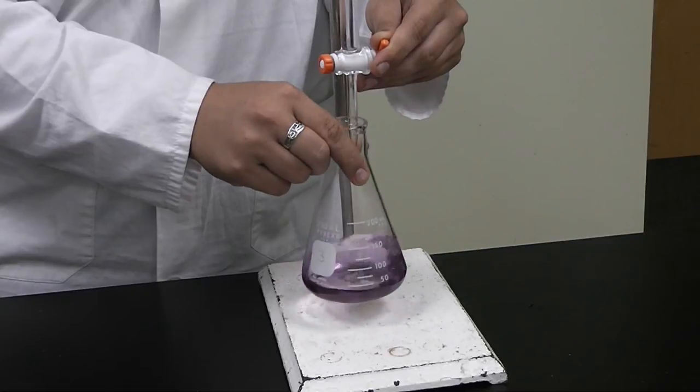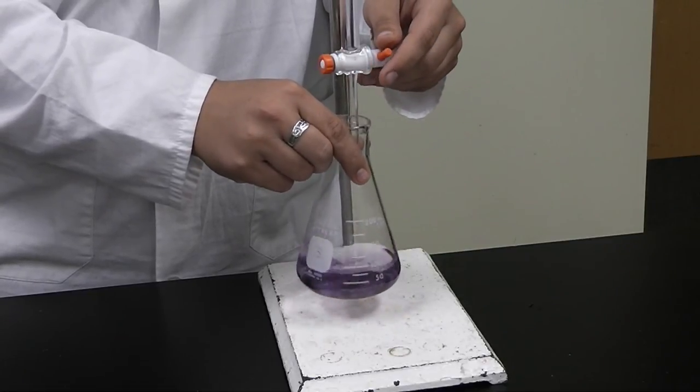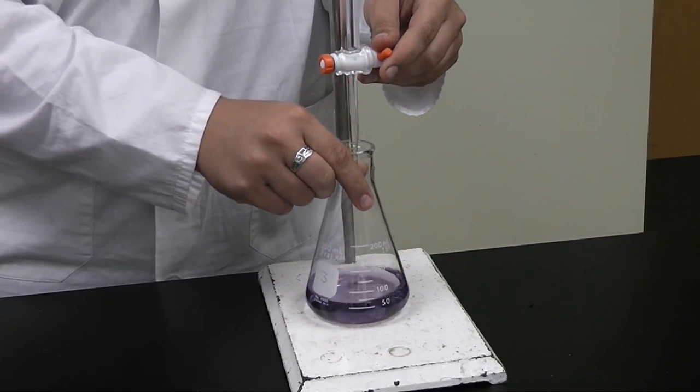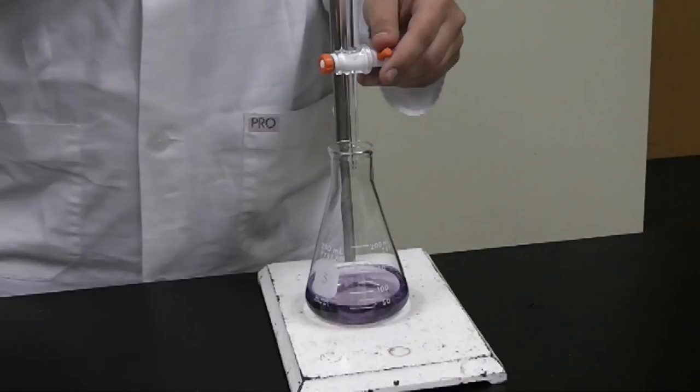You can add a half a drop by simply turning the stopcock gently until a drop begins to form at the end of the burette, but does not fall into the solution. Simply touch the burette to the Erlenmeyer flask and the drop should fall in.